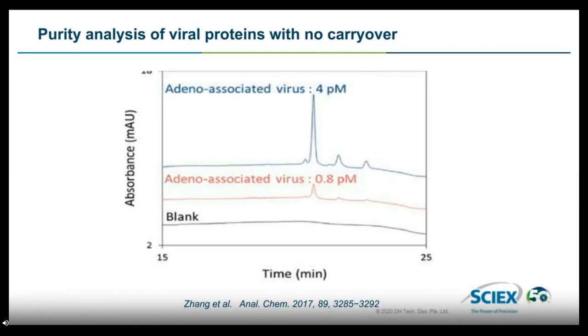One of the other benefits of using CE in this respect, and this is more so than HPLC, is that with CE you actually replenish the separation media between every injection, and you clean the surfaces of the inside of the capillary between every injection, so there's no carryover. And again, this is really important when you're generating reproducible data. The removal of carryover is essential. And I know from prior experience myself that LCMS or LC analysis can sometimes suffer from carryover, and CE generally does not suffer from carryover at all, and it's easy to remove.